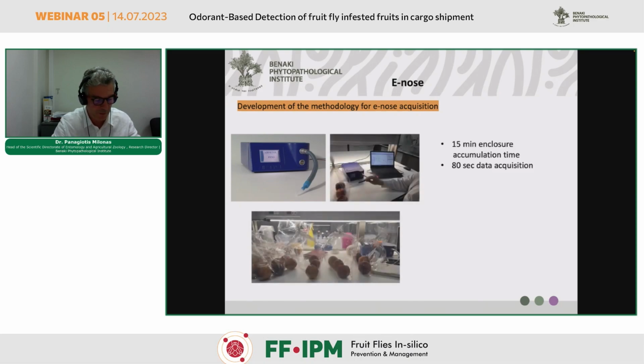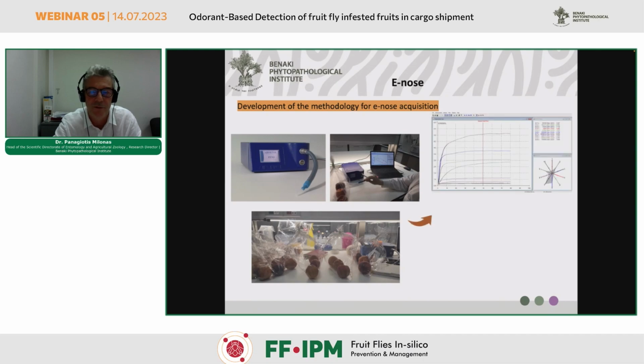A few words about how we train this equipment. We again created different categories of fruits, infested or non-infested, and different time intervals from infestation by the 3 different fruit fly species. And in order for the equipment to operate and to take a reliable sample, the fruits are placed in a bag, in our case, for 15 minutes, so we have an accumulation of vapors within this bag, and then for 80 seconds we have data acquisition with the electronic nose that we use.